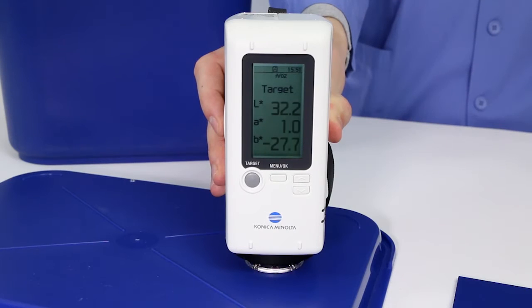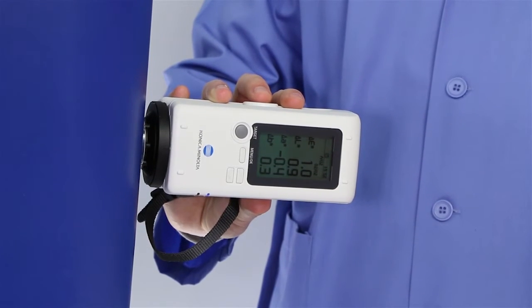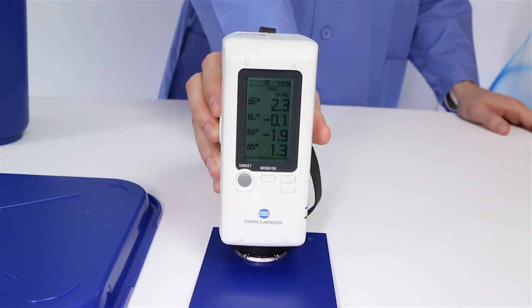This cost-effective technology helps manufacturers and quality assurance professionals worldwide ensure consistent color.